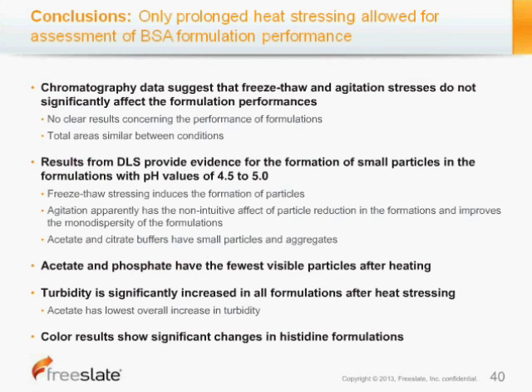Okay, so then the conclusions from the actual performance of the different formulations. One overarching theme here is that because BSA is so stable, and because these formulations were performing relatively well at the initial time point and with freeze-thaw and agitation stresses, really only the heating stress could give us any information to evaluate the formulations' performances.